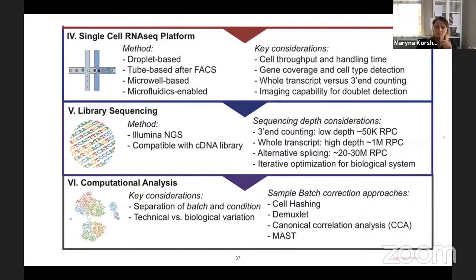I just would like to mention that, talking about this bridge between bulk sequencing and single cell RNA, there is a set of tools which can do some kind of deconvolution of bulk sequencing and impute the cell types and the proportion of the cell types with the assigned expression matrices from single cell state. So if you would like to do computational analysis and you can operate just with bulk sequencing data available in your lab, you already can use a lot of tools to do this very rough artificial experiment of deconvolution of bulk sequencing samples.